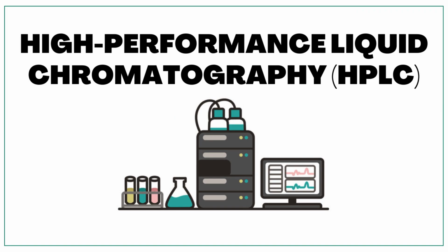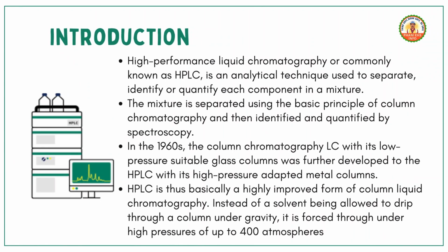Today, I want to tell you about high-performance liquid chromatography, or HPLC. This is a powerful tool that scientists use to separate, identify, and measure different parts of a mixture. It's important in many fields like medicine, environmental science, and food safety.